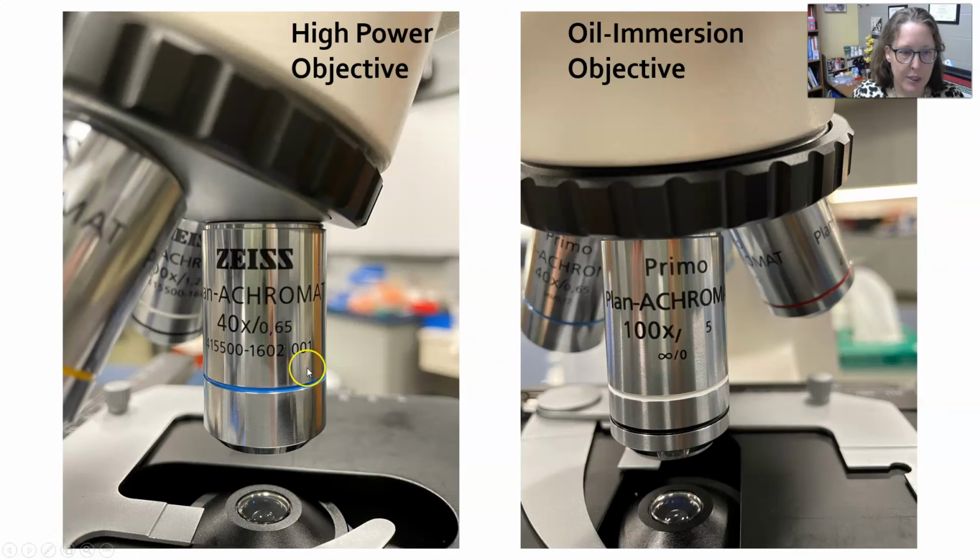40x is a magnification, 0.65 is a numerical aperture, and it has some other numbers on there. This one's color-coded, and I believe this is pretty universal. At least all the microscopes I've seen seem to match this color scheme, where blue here is going to be 40x, and yellow is low power 10x.